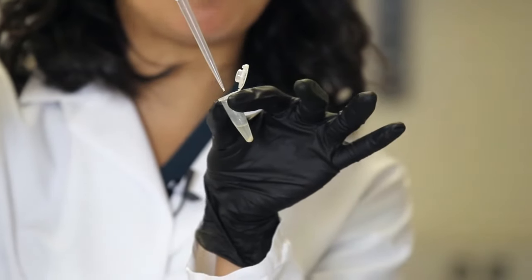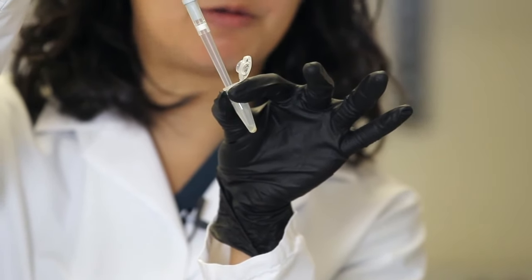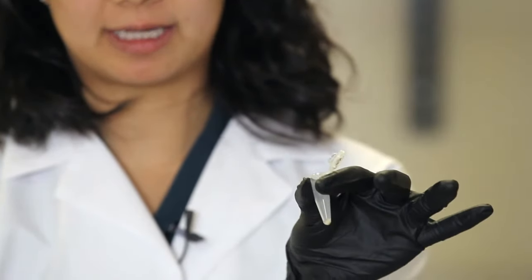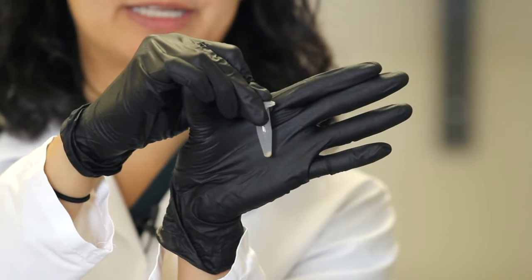You want to make sure you don't put your tip all the way to the bottom where it's going to touch the bacterial pellet, but just let it skim gently at the top while you slowly remove all of the liquid, just like that. This will leave you with a nice, clean pellet at the very bottom, free of any supernatant.